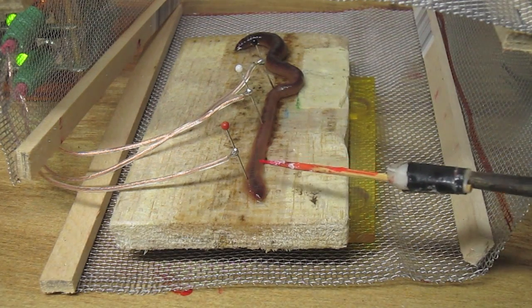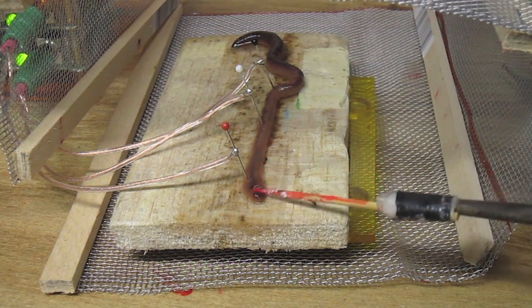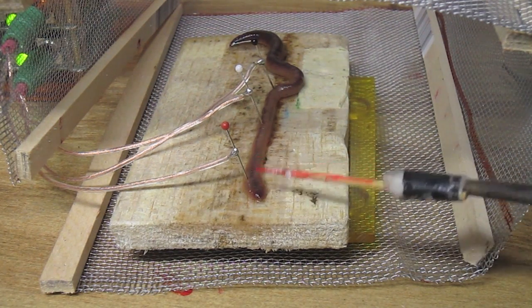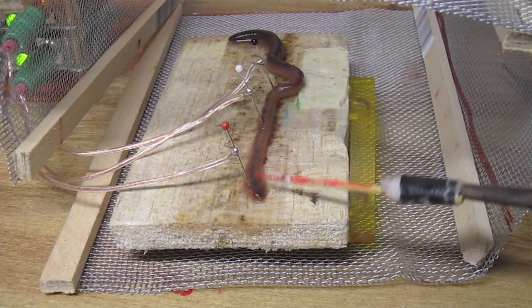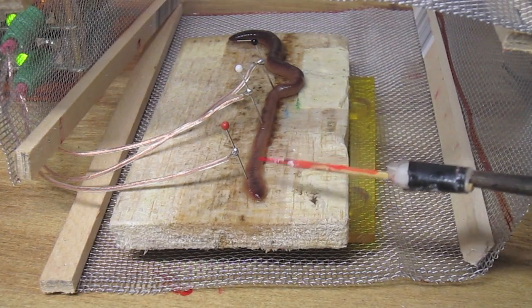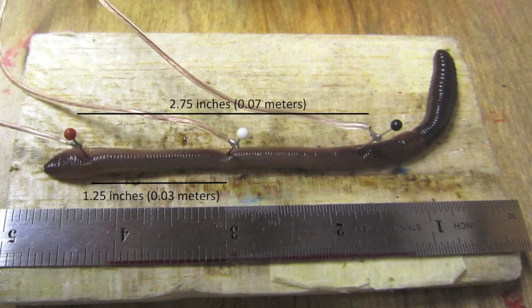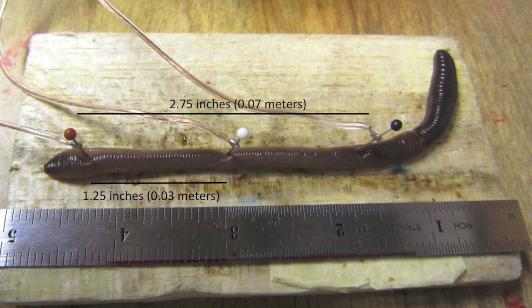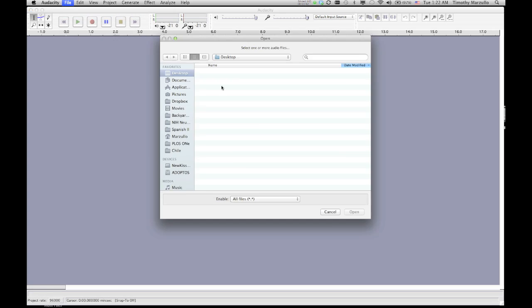What you are hearing are one or two spikes elicited when I touch the posterior end with a toothpick. Now, since I'm brushing the posterior end, the spikes then travel down the length of the earthworm past the two electrodes. Let's take a closer look.